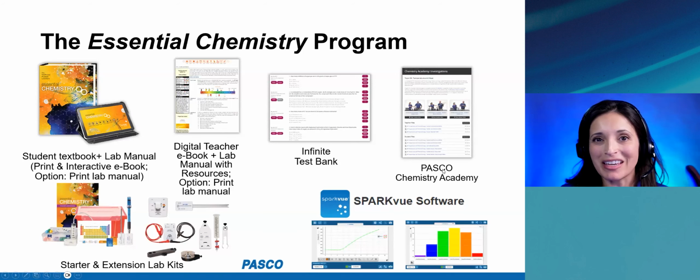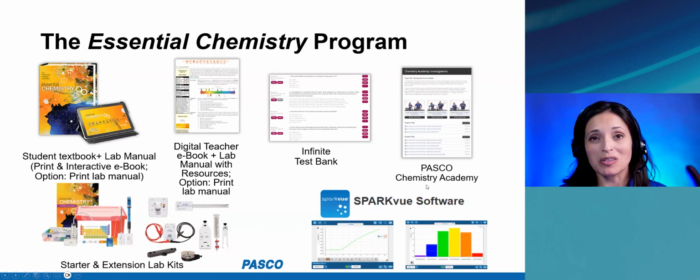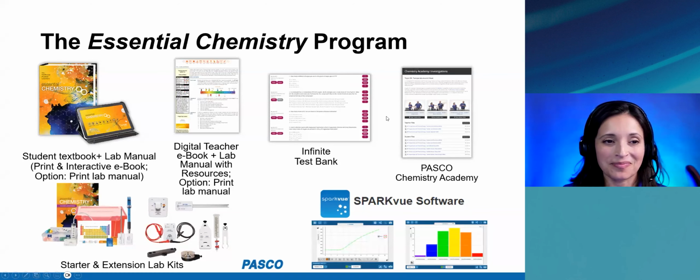And on top of that, there's this piece called the PASCO Chemistry Academy, where we walk through some of the labs in essential chemistry. I'll go over that in detail towards the end of our time together.